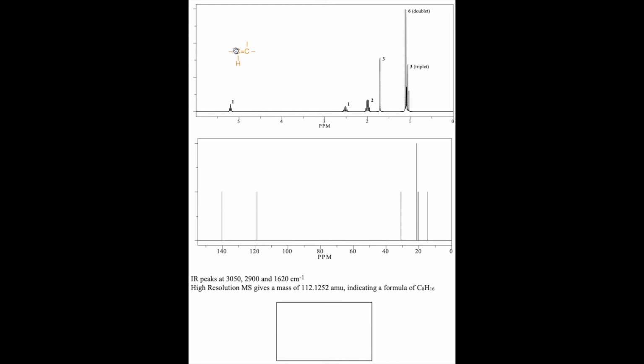And that means that this hydrogen here must be attached to some other CH2. So I'll put it here in blue. And again, my CH2 has to go on to one more thing, so I've got that extra bond there. Now look at all that connectivity we've got, just from that one little wiggle on a spectrum. We got all that put together. Now, admittedly, part of the reason we got that far was by looking at some of the other information below, but that's a lot of stuff we can squeeze out of that one little wiggle.